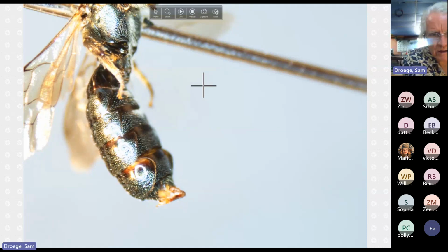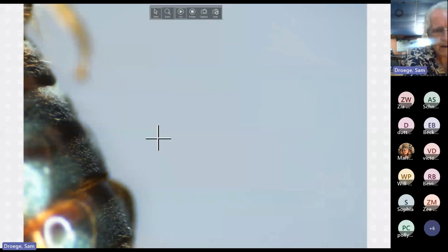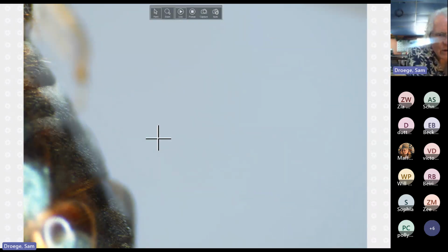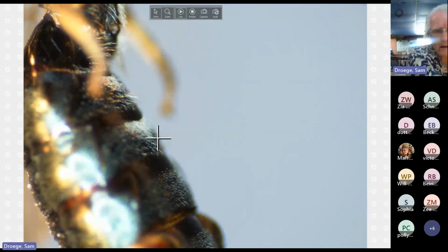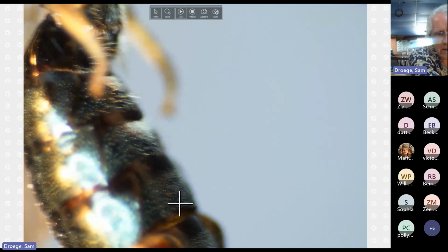The best way to do this is from the side, because underneath are hairs. So this looks basically hairless. You can see a few here. I'll jack up the magnification and move this a tiny bit more in. So again, we're looking at mikmaqi, and there are hairs here. A bunch of small ones are simply prone, lying down, pressed down in some way, and certainly not sticking upright.